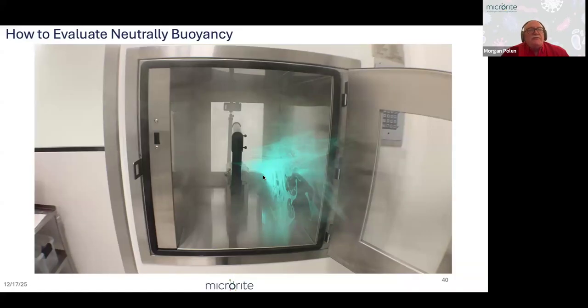So what is important is unidirectional airflow in a sweeping action, and then, of course, air velocity. If you look at USP 1116, it talks specifically about how smoke studies may provide us more information than looking at air velocity when we're trying to gauge things. So this is why both guidances talk about smoke studies; air velocity should coordinate. But getting attached to 0.45 meters per second at the working height is going to get you in trouble. I've seen companies rip out their diffuser membranes just to do their air velocity measurement to show, look, we're at 0.45 meters per second at the working height. And then they no longer have unidirectional airflow because they have gaps between their HEPA filters. So it's important to understand how the air velocity and that sweeping action are supposed to tie together, because I've seen companies wind themselves around corners or in knots trying to get that magical air velocity. And the point being, it is a guidance value.